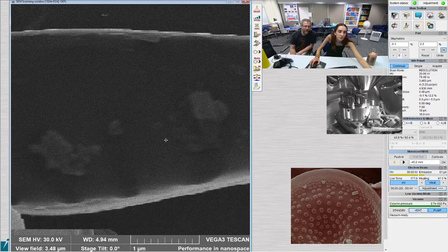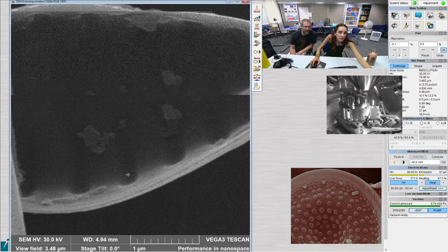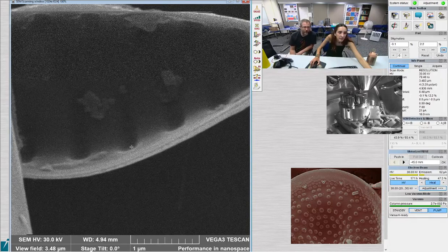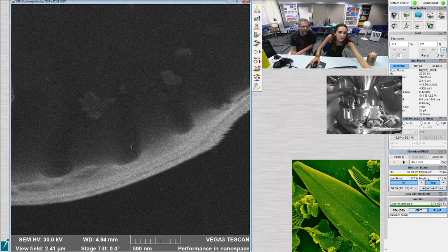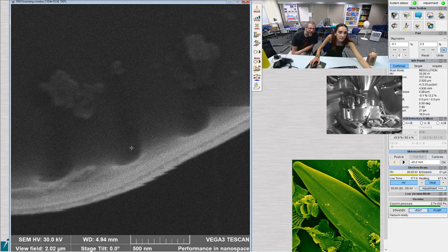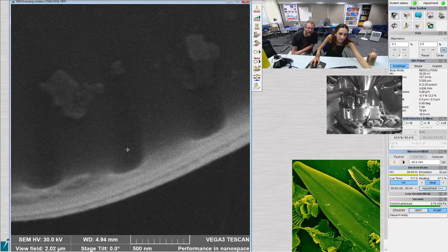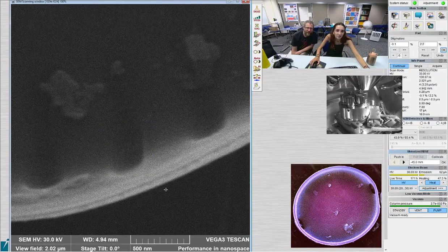Just want to see. Where are they? Yeah, any of those. Can we see anything on them? Yes. Because there were also some things in here that had punctae and striae, and we didn't think they should have that, but they did. Ooh, those are weird. I don't think we can get it. No. Okay.